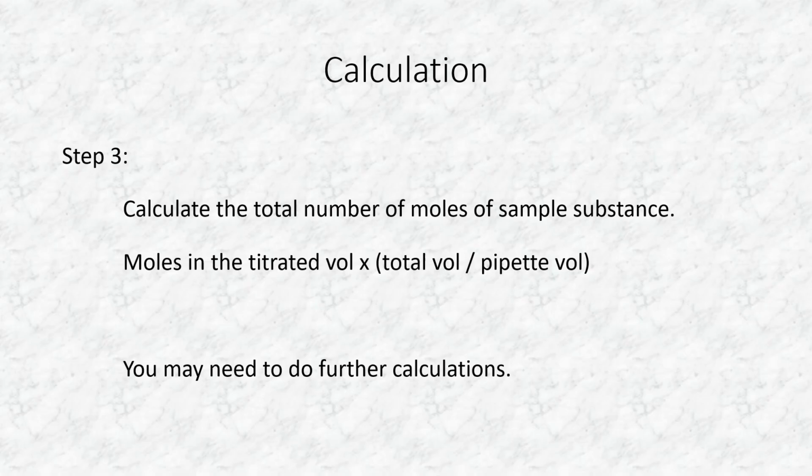So what have we talked about today? We've talked about what is titration. It's that analytical method to work out the concentration of a sample. We've talked about what the terminology around it is, what the apparatus you use, how to do the titration, and how to do the calculation.